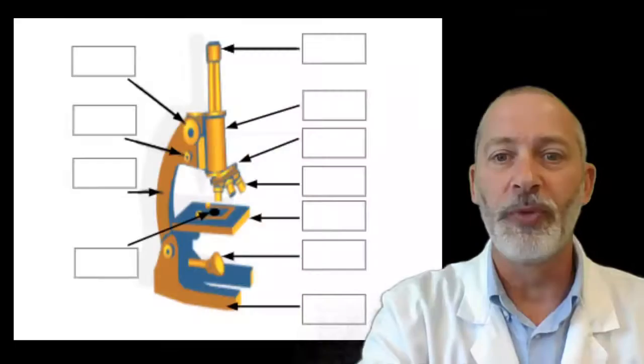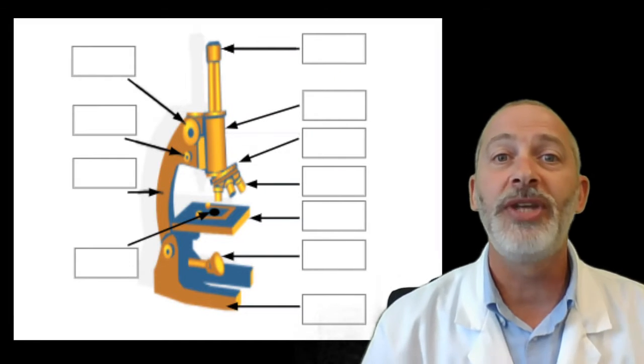We're going to have some fun doing some things to figure things out about your eyes and how we use your eyes to use the microscope. So, here we go. Let's get started with first where we left off yesterday.